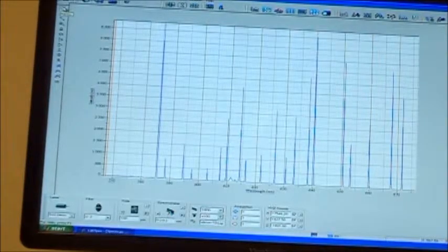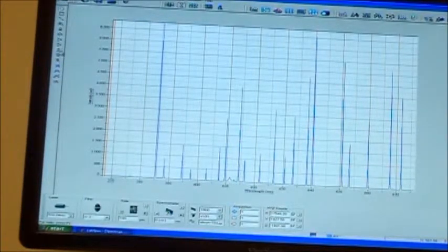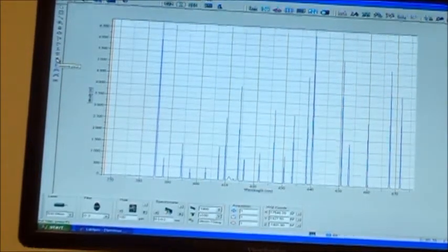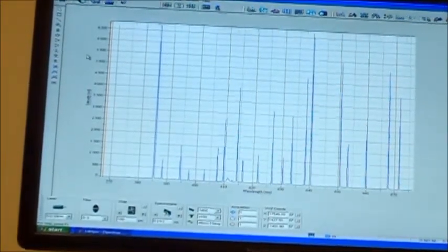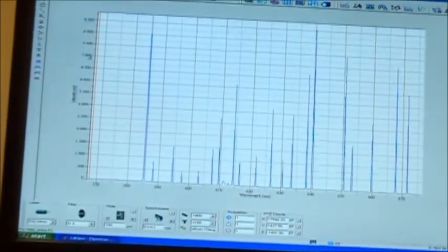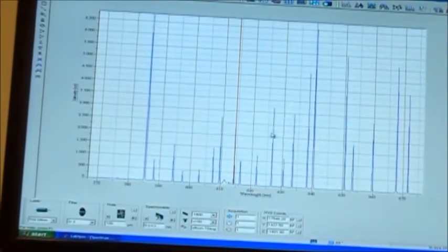So next we will go down these icons here, down the left side of the window. The icons on the left side are only going to be visible when you have an actual spectrum open in the software. The top one is called pointer. It is used for cursor manipulation to move your cursors around the screen.